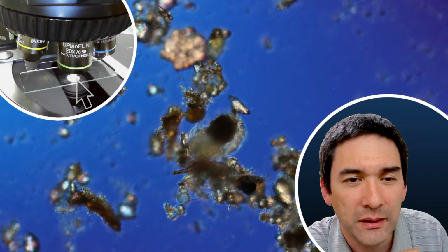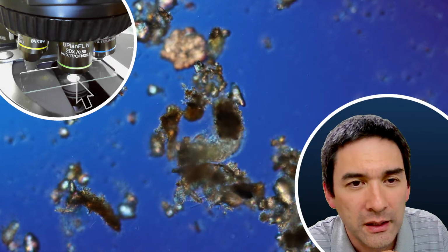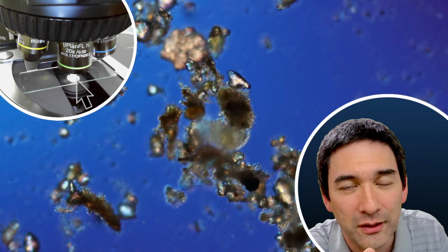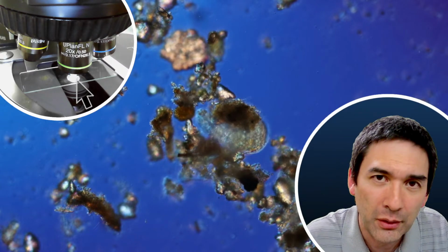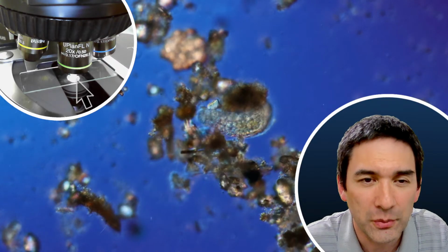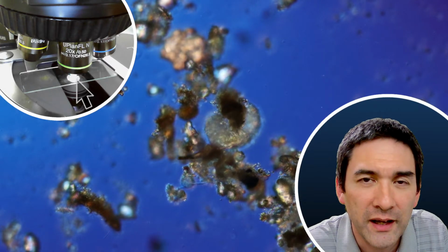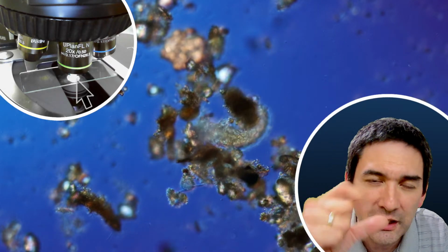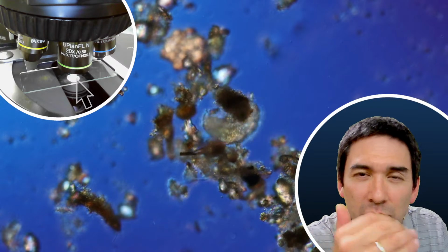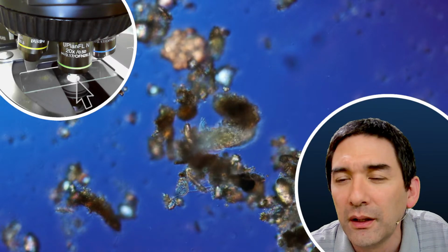But in most cases, the dust is out of focus. Sometimes, if it's really disturbing, like on my other microscope, I had a very disturbing piece of dust directly on the optics of my lamp. So I had to take apart the microscope and clean the optics of the illumination system because there was a really bad speck there. And what I suggest, if you want to find out where the dirt is, is to rotate the different parts. Rotate the eyepieces and see if the dust or the dirt also rotates, so that you can narrow down where the dirt is.